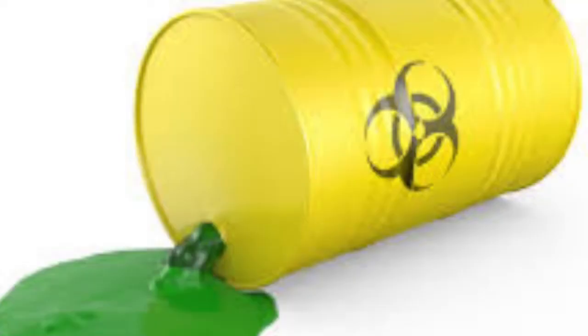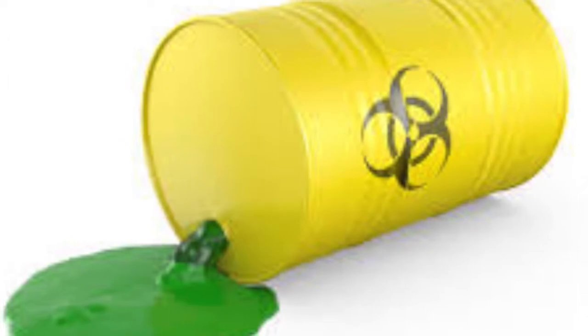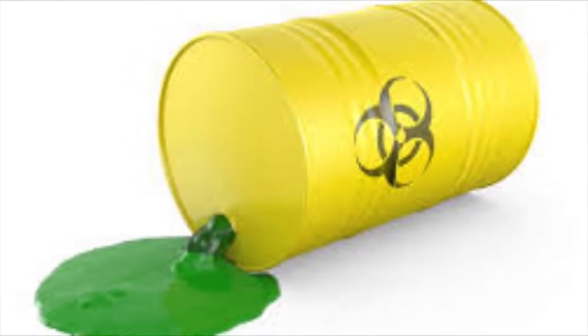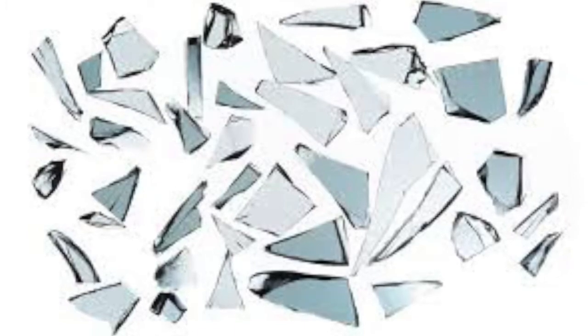For example, if you had a chemical spill, that could cause burns, so what you want to do right away is notify a teacher. For example, if there's broken glass, that can cause cuts. And if there's no chemicals, you sweep it up yourself. But if there is chemicals in the mixture, you need to get your teacher immediately. If there happens to be a case of burning chemicals, which can cause burns or fumes, you need to notify a teacher right away and step away immediately.